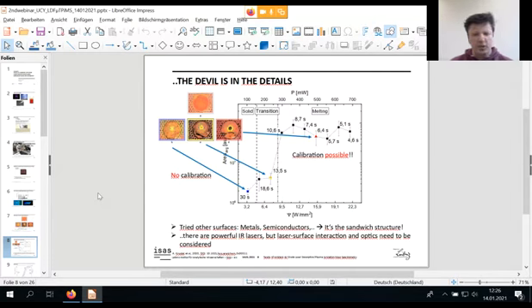We even tried out other structures, such as pure bulk metals and semiconductors, but the key element is that we need a sandwich structure, because we need to keep the temperature on the surface. It's not efficient to have heat transfer all over the surface, so we need to keep it in a very, very thin layer to make sure that we can get the analyte desorbed.